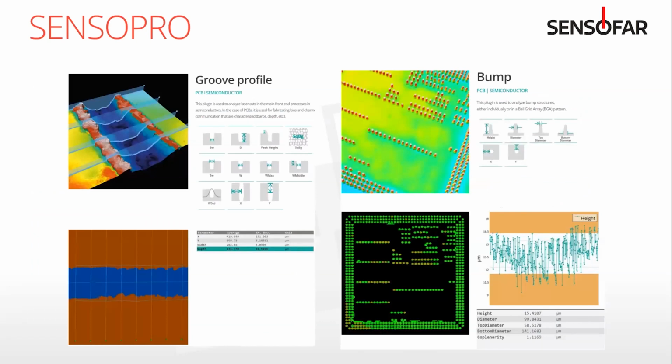Or, for example, you are interested in taking multiple profiles across a trench or a groove and looking at their depth, their width, their max width and depth, their average, whatever you'd like. That's possible as well. And then lastly, the bump plugin, again for the semiconductor industry, analyzes a ball grid array pattern and tells some information about that.